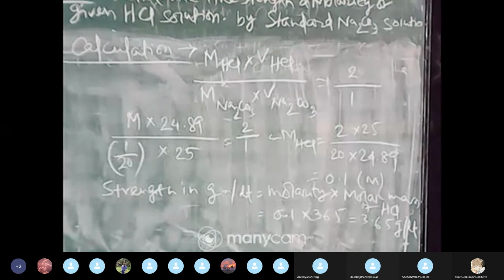Okay, now you can prepare, you can write. I am telling about the part that Anindo is inquiring about, the preparation of standard solution of sodium carbonate. At the first experiment I gave you, that was to prepare a standard solution of oxalic acid.